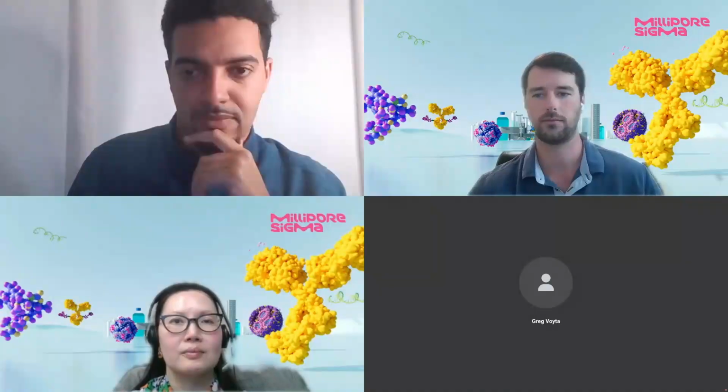So the combination of those two helps you build models from scratch. There are also ready-to-use models that will be included in the Bio4C Raman software. That would bypass the need to generate your own specific models, and we'll be able to do the real-time monitoring just from that initial Bio4C platform or software. Okay, great. Thank you, Alex, for that answer.